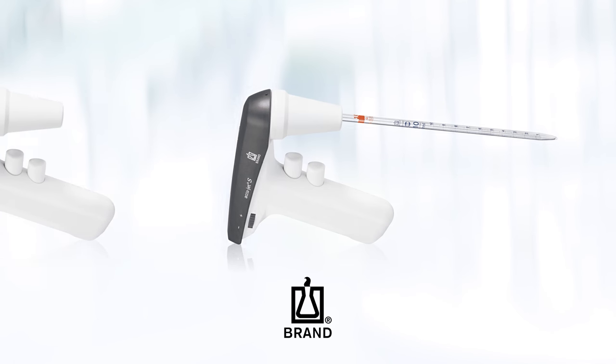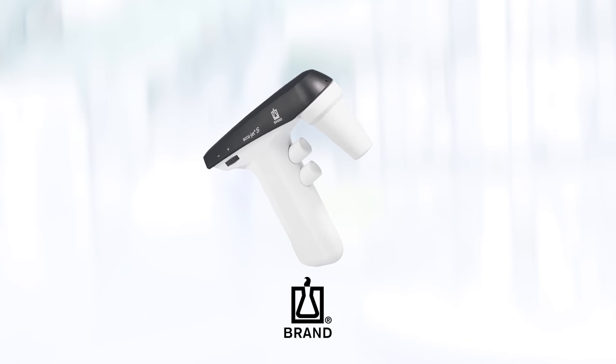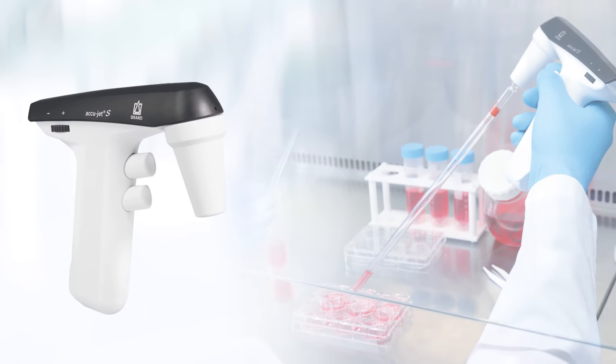You'll need to install the battery in the AccuJet S Pipette Controller prior to using it for the first time, or if ever you need to replace the battery.